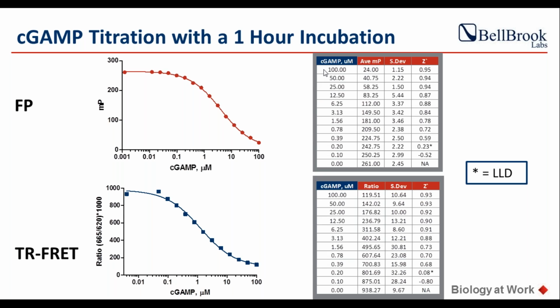If your initial ATP is, say, 10 micromolar or 100 micromolar, you might need to adjust your antibody concentration. We need to do that because those antibodies have some cross-reactivity with ATP and GTP. But as I had shown in one of the previous slides, the cGAMP antibody does not bind to ATP or GTP, and therefore running a standard curve is really easy.